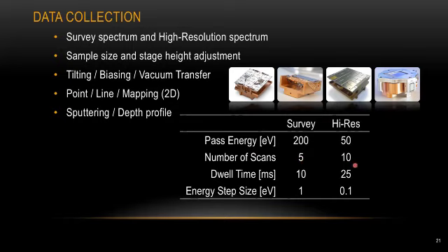Another side note: if you're planning to do some quantification analysis or quantification comparison from different spectra, all the spectra should use the same pass energy, so the data will be comparable.